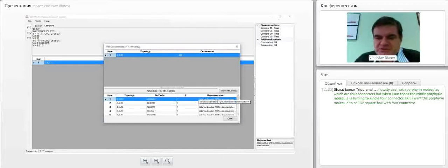This means again, what is standard representation for coordination polymers? This means that the nodes correspond to metal centers and ligands. No clusters, no polynuclear coordination groups here, just metal centers and ligands. And for example, the second example, here we have hydrogen-bonded molecular structure, again standard representation.